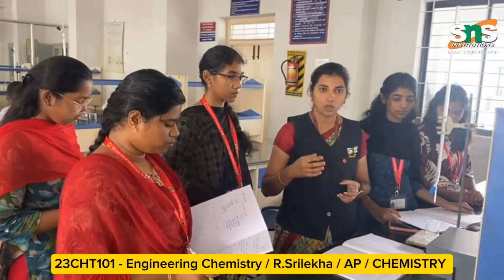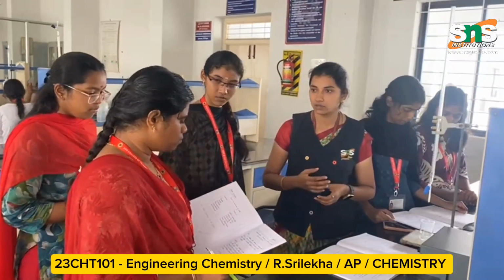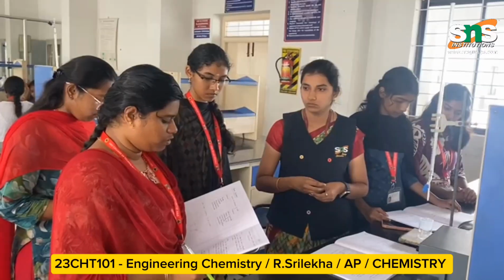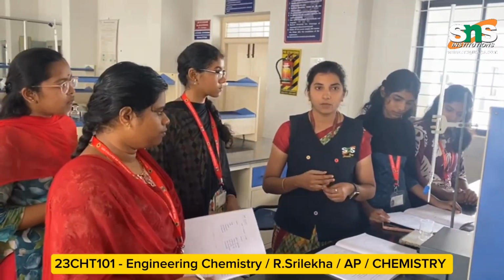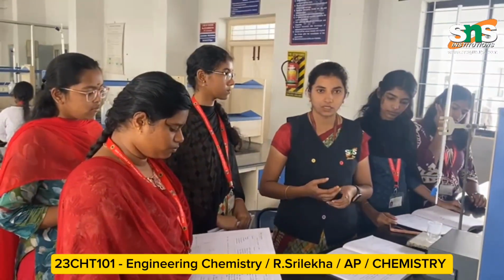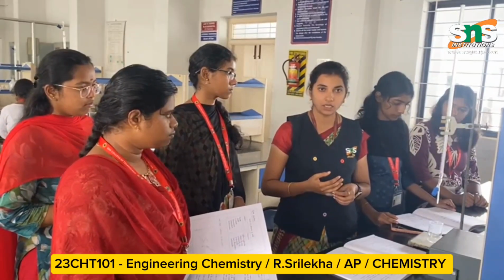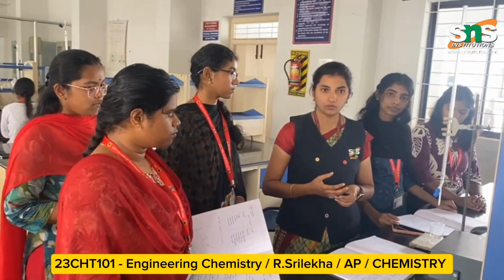Now I will describe the aim of this experiment. So tell me, what is the aim of this experiment? To determine the amount of a strong acid and a weak acid present in the whole of the given solution. A standard solution of 0.1 N NaOH is provided. So the aim is to determine the weak acid and strong acid in the solution of HCl and acetic acid, by checking the burette solution and the pipette solution with their normality and the volume of the HCl.